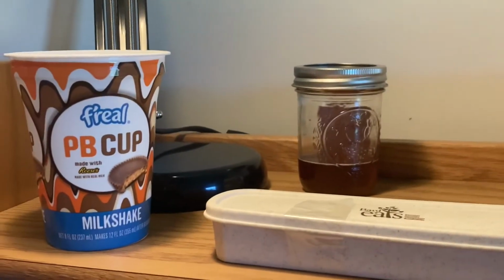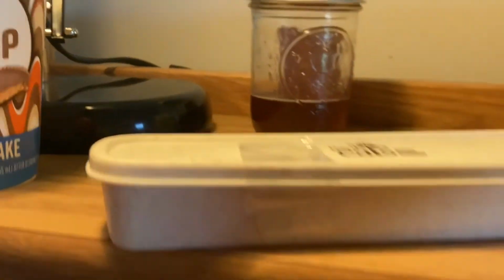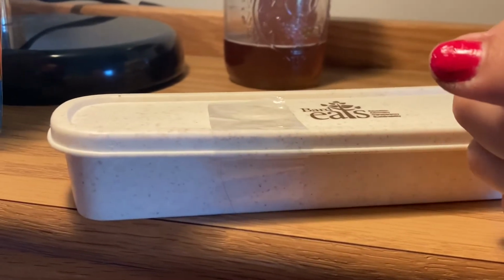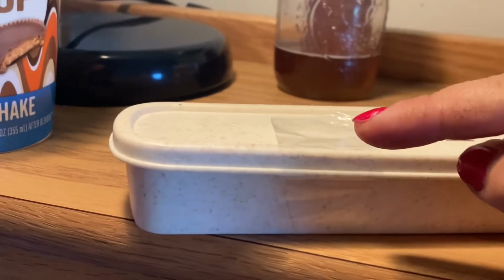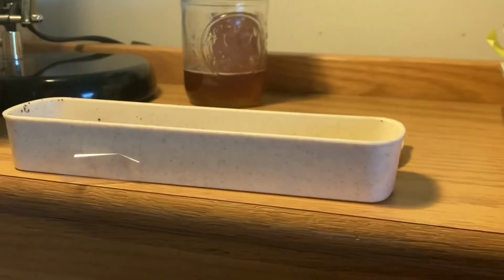Pipette tips come in 3 different boxes, each color-coded to match the color of the pipette itself. You want to make sure that your box of tip containers still has the autoclave tape on it. That means that the tips are either new or used but have been sterilized. If your box does not have this tape on it, do not use those micropipette tips.